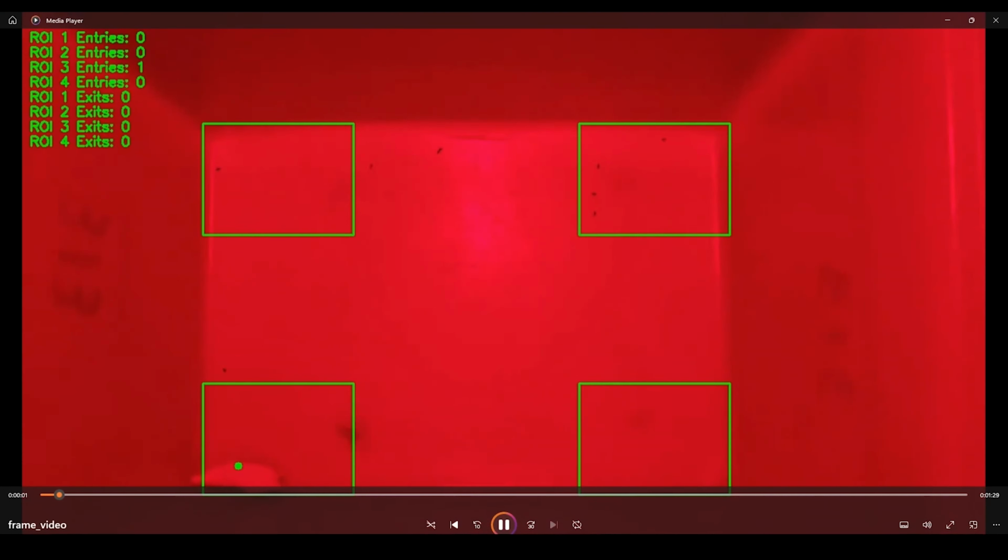And in the video frames, you can in fact see that there are not so many multiple instances of center of mass. The other way to improve the accuracy of your model is, of course, by giving it more training data and training it for a longer period of time.